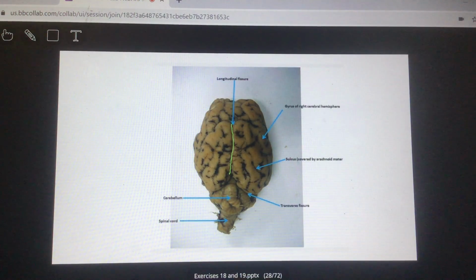And again, here we could ask for frontal lobe. Why? Because this is posterior, right? Anterior is frontal. Occipital lobe is going to be back here. Parietal lobe is going to be here, right? And temporal, occipital, frontal, parietal. Oh, temporal. Guys, side, right? It's going to be just the side here. Because I don't think we have the lateral image of the sheep brain. So it's got to be the side.